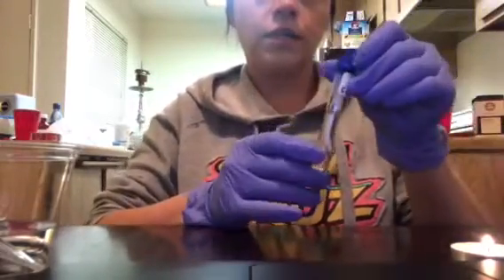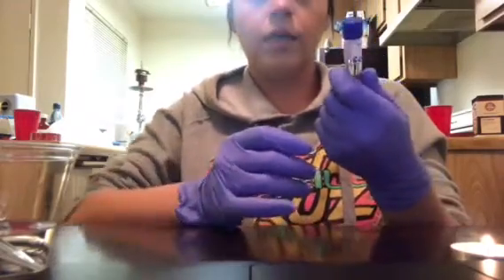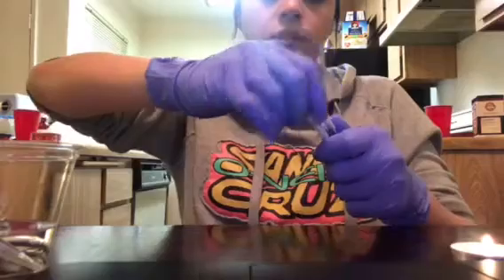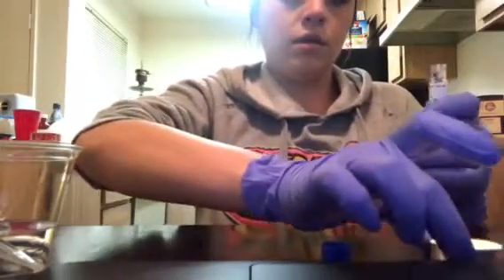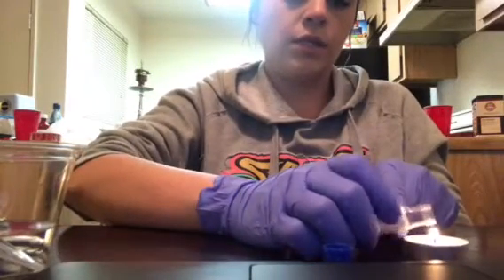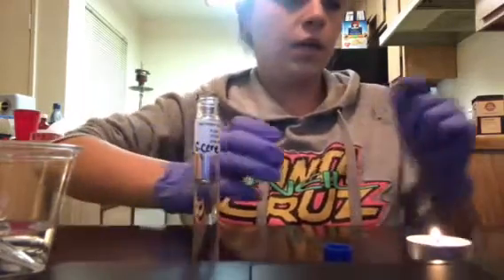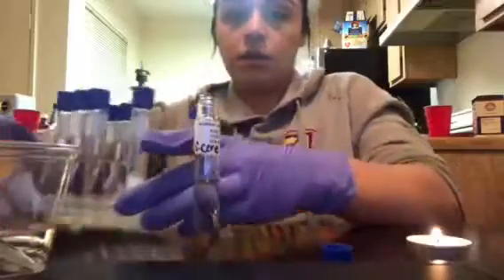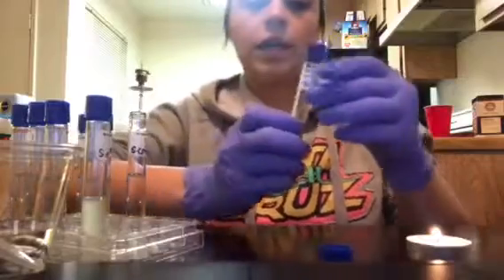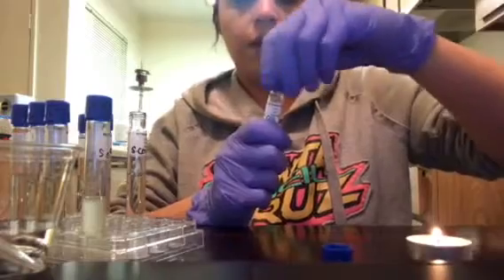So first I'm going to take the first Cerevisiae broth with the 1% NaCl. So I'm going to open that. So what I first want to do is flame the lip to sterilize it. Set that to the side. Actually, let me bring this over here. Set that here. And then I'm going to take the active culture of the S. cerevisiae and flame that as well.